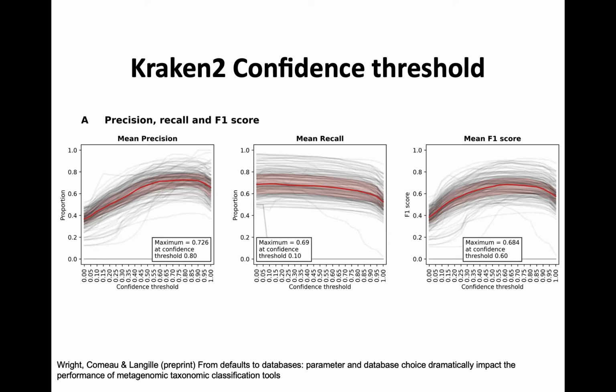Yeah, Robyn's here. She can take all your questions. She did a lot of parameter tuning. I just showed Kraken parameter tuning. We tried a lot on MetaPhlAn too. It didn't really affect things too much.